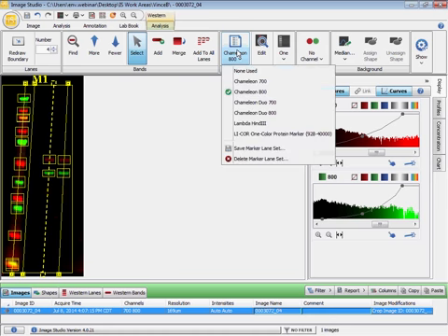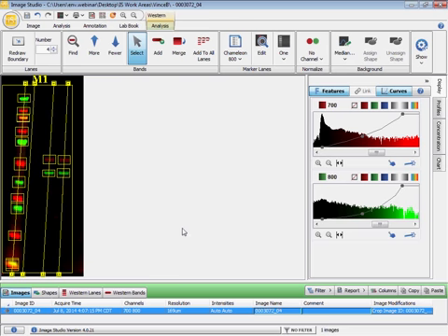And this way we have a separate marker lane set for each of the 4 products that are available from LI-COR. So now that you've defined the marker lane sets for the Chameleon ladder and you've used the Image Studio software to find bands as we discussed earlier, you can use these sets to estimate band sizes for not only the current image but also for any future image analyses.